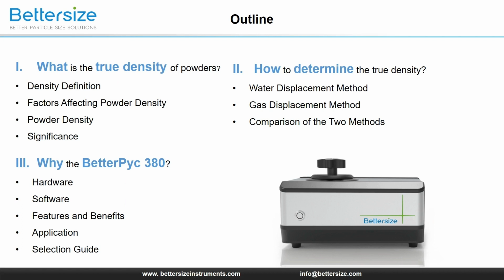By now we have gone through all the sections of this presentation. First, we got the answer to what is true density, then explored how to determine it, and finally, understood why the BetterPyc is used to start your measurement. Well, that brings us to the end of this presentation.